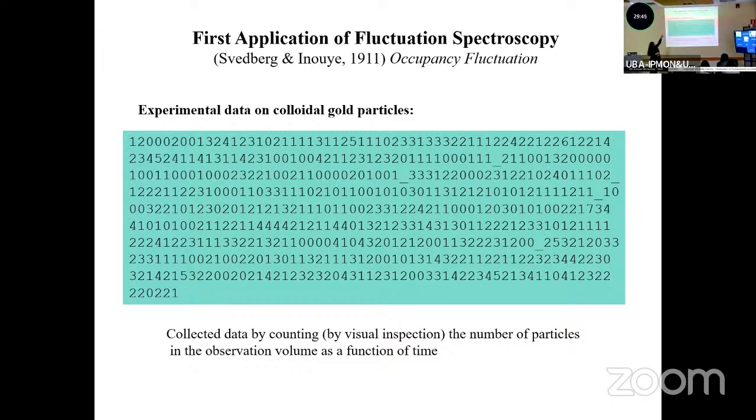So at some point, Dr. Schwetzberg, he had a metronome. If anybody knows what a metronome is, a clock. So he said, every second, I'm going to tell you the number of molecules I see at that time. Okay, so he saw 1, then he saw 2, then he had 0, 0, and he kept counting. And eventually his eyes got tired. He had to blink.